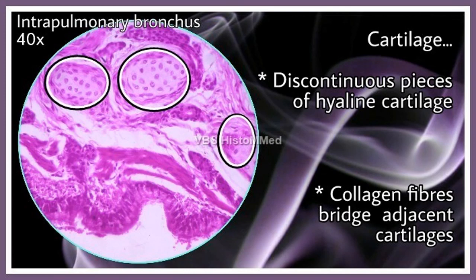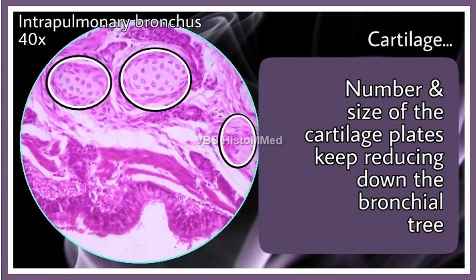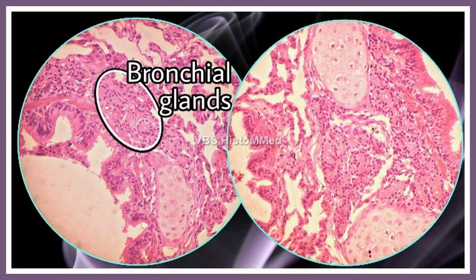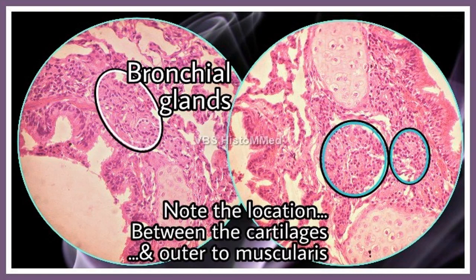The cartilage: once intrapulmonary stages are reached, the cartilage becomes discontinuous, appearing in small islands. In between the islands, collagen fiber bridges can also be seen. The number and size of the cartilage keeps reducing as you go down the bronchial tree. Finally, there is a spot where there is no cartilage at all — from that point onwards the bronchus is relabeled as bronchiole. There are also a few bronchial glands for local secretions, both serous and mucous, located between the cartilages and outer to the muscularis — a very important submucosal location.